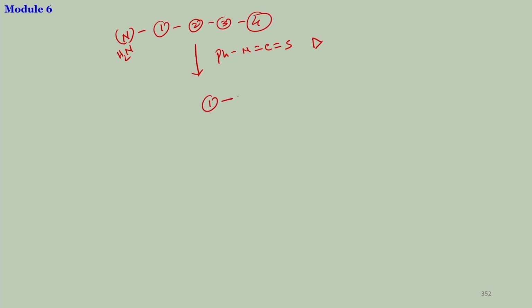So you form this kind of complex, a marker reacting with the amine group. Once this is done, then comes the degradation. It breaks this peptide bond.